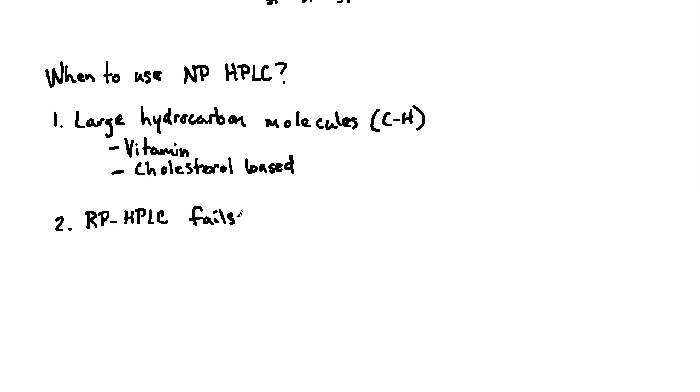If I'm buying a lot of hydrocarbon specialty solvents in comparison to water or some of the mass-produced alcohols that tend to be a lot more affordable, that is something to consider, okay? And you have to keep in mind that when you're doing this, cost is a factor, right? So it's one thing to sit and talk about the theory, oh, this is how it works, and this is how you can separate, and these are how you optimize.